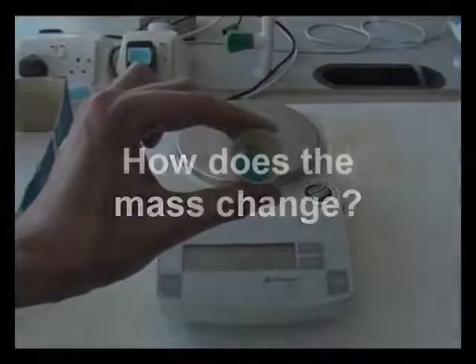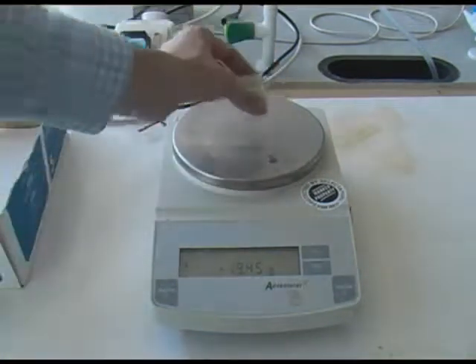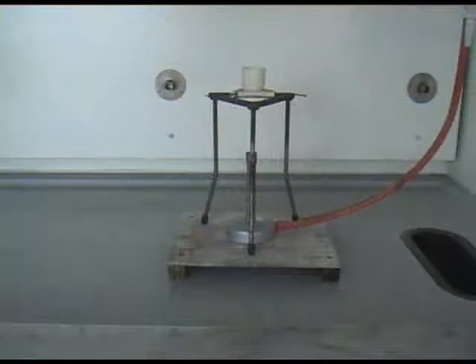In this video we're going to look at how the mass changes during a chemical reaction. Here you can see some blue copper sulfate crystals in a crucible. We've already weighed the crucible, so the mass on the balance will tell us how much copper sulfate we've got. That's 1.50 grams. We now heat the crucible on a roaring blue Bunsen flame.